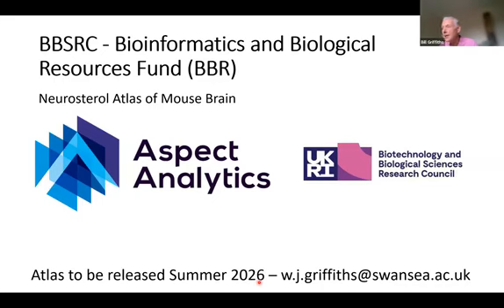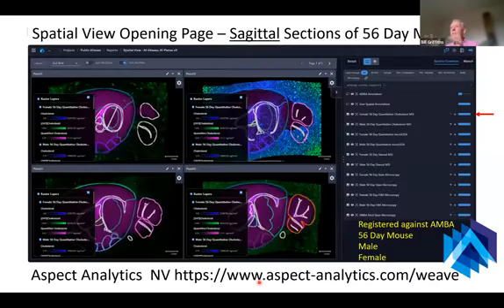So let's show you what the atlas looks like. When you open the atlas, you get what we call the spatial view. In the atlas, we've got sagittal sections of mouse brain, which are matched to the Allen mouse brain atlas. What we see here is the first 4 plates of the Allen mouse brain atlas, starting at the outside, moving towards the center, and we've got all our data overlaid here on the Nissl stain of the Allen mouse brain atlas. So all our data is registered against the Nissl stain of the Allen mouse brain atlas. In these 4 plates, we've got all our data just overlaid.